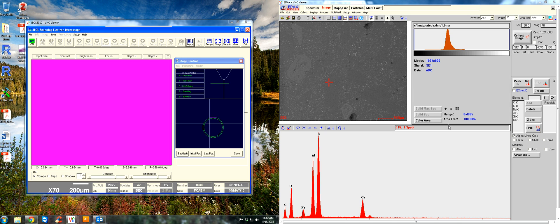Alright, let's do quantitative analysis on the Genesis software, part 2, in the spectrum tab.